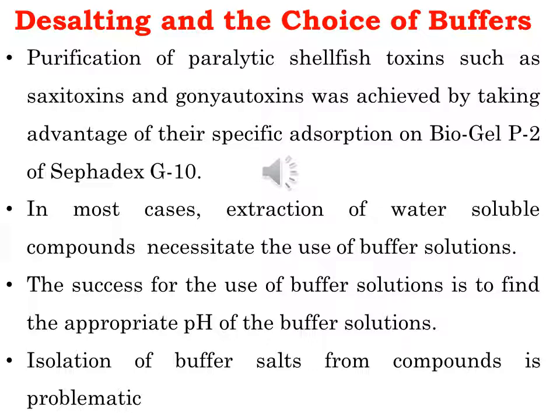In most cases, the extraction and fractionation of the water-soluble compounds necessitates the use of buffer solutions. After all is said, the key to the isolation of water-soluble compounds is finding suitable pH and ionic concentration to keep the molecules as individual molecular entities separatable on a given matrix. However, the separation of the buffer salts from the compounds is not an easy task.